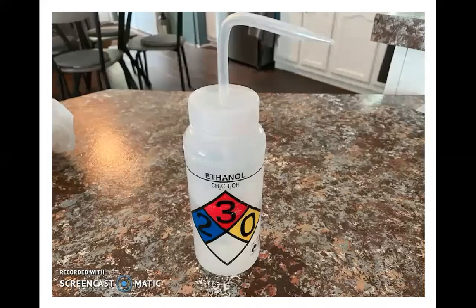We use an alcohol solution of anywhere from 60 to 90%. Typically, it's about 70%. And we use a 10% bleach solution. Both of those things are rapidly bactericidal. They will kill bacteria on surfaces very quickly, and that's why they're so effective.